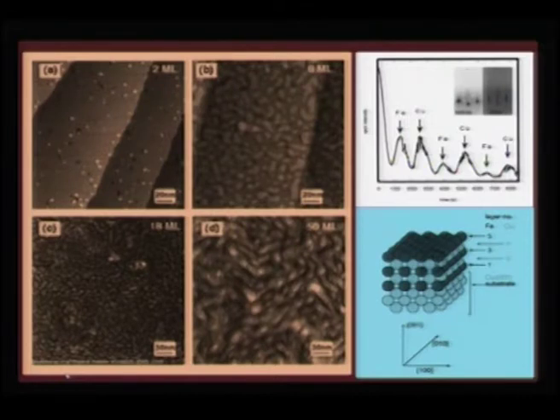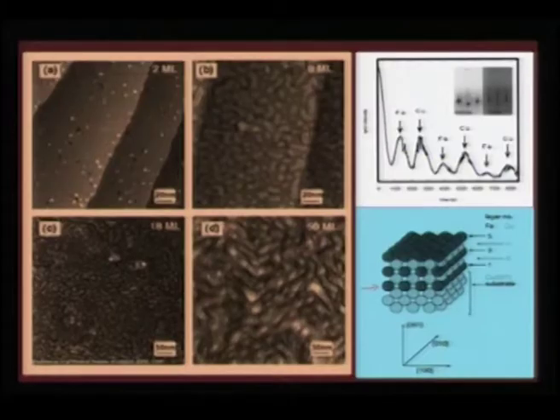deposition. This is another example which I have briefly mentioned in module 2, which I want to revisit. Suppose I want to make an artificial alloy where I am going to put one layer of iron, one layer of copper, one layer of iron alternately and keep on growing an artificial alloy, because iron and copper are immiscible alloys. Then I can easily map whether such an alloy can be formed, because the first layer which I have deposited here as iron can be seen here.